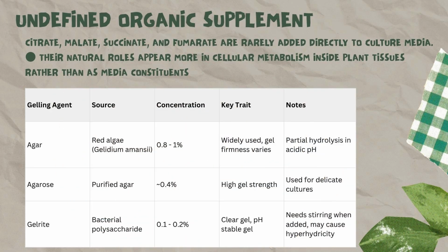Next, undefined organic supplement. Compounds like citrate, malate, succinate, and fumarate are not typical media ingredients. Their main role isn't in the medium. They are naturally involved in the metabolism happening inside plant cells, not as direct media additives.